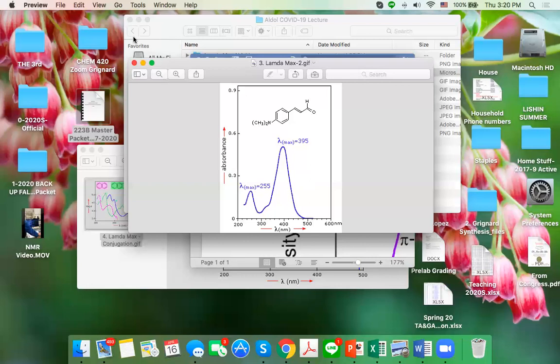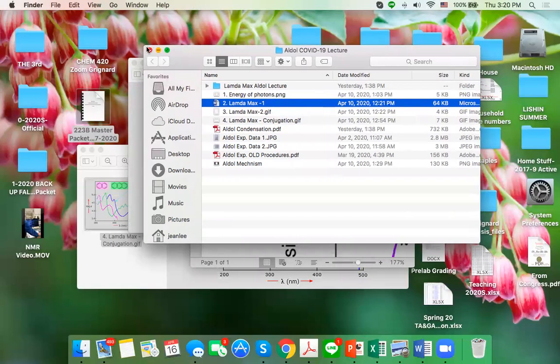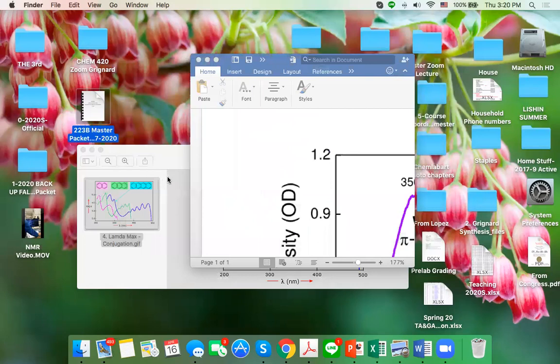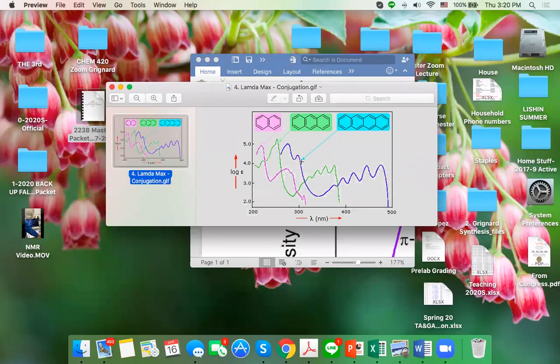And for today, okay, I just want to give you some appetizer about the UV behavior of a molecule, okay? They're all very unique, okay? Look at this. Ladies and gentlemen, do you see this molecule in pink? Wow, the UV absorbance, the UV absorbing behavior. It's the pink line. The green, and then the blue. Okay. The more conjugation, you see the peak is actually trending to the right-hand side, right? That is the longer wavelength, right? Okay, I'll talk about this next time, okay?